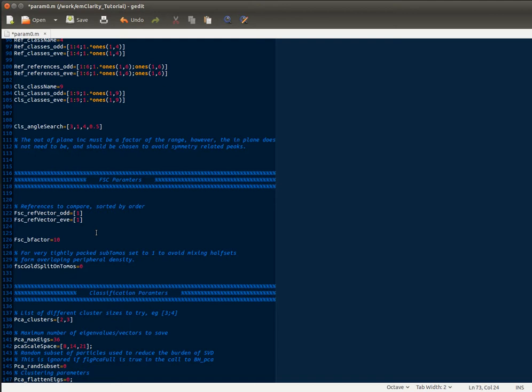The FSC parameters—there's only two that you need to consider for basic usage. There's the FSC B factor, which you want to have greater than zero, but for regular alignment you want to keep it less than 10, and that really just applies a correction for the detector's MTF. In a final alignment you could change this to something to apply a B factor sharpening, say of 100. The FSC gold split on tomos is an important parameter depending on your sample. So for the ribosomes and for anything that's pretty well isolated, we would have this set to zero. And what that does is it randomly divides your data from the template matching into two even and odd half sets just based on the total number of subtomograms.